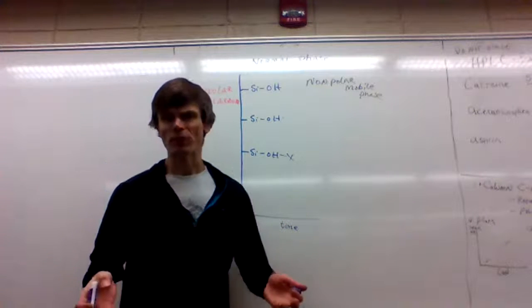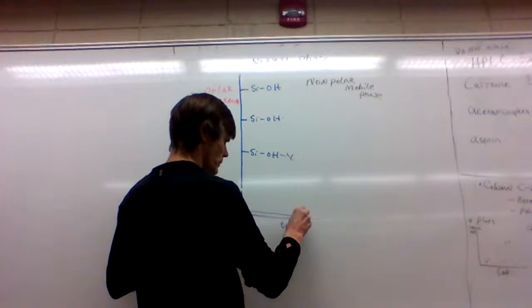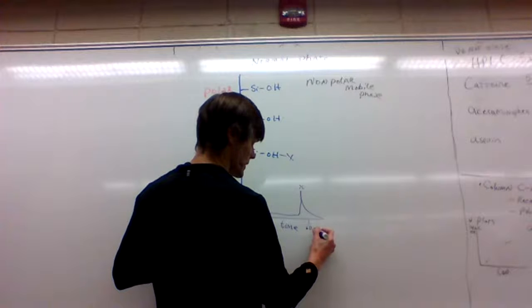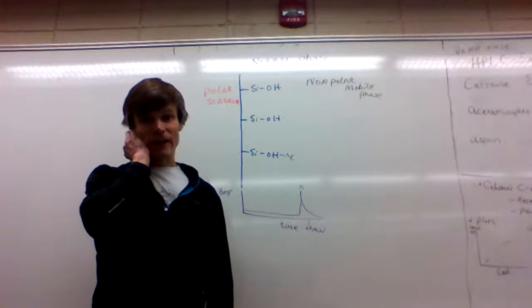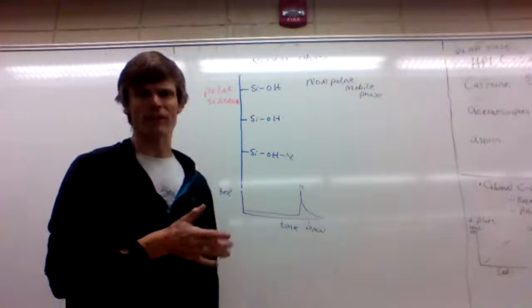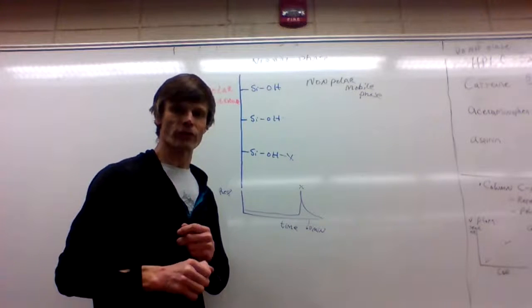Again, normally we're going to have multiple species, but just so you understand what I'm discussing here. And what we would find is that our sample X comes out down there. And if we had this on a time scale, what if we found out that this took 60 minutes? And you're working in the lab, you're a grad student or a researcher, and you're like, man, that took a long time to get that guy off there, and I got better things to do with my time. How can I reduce my run time? How can I reduce the time to get that polar substance off there?